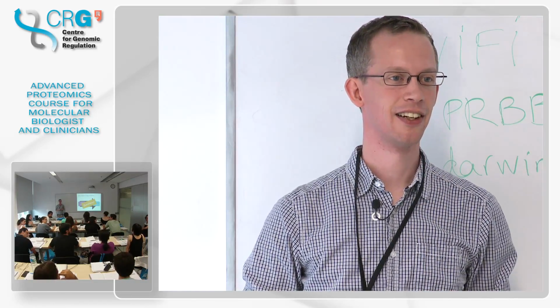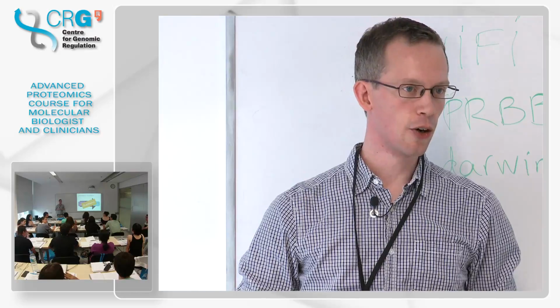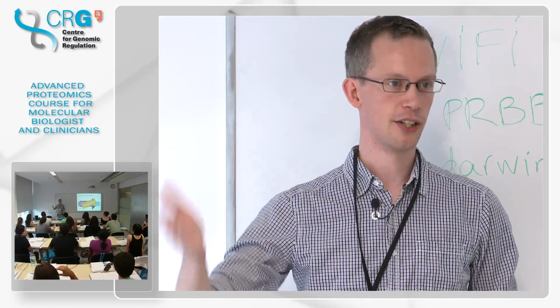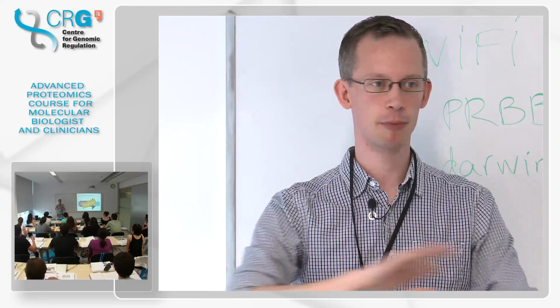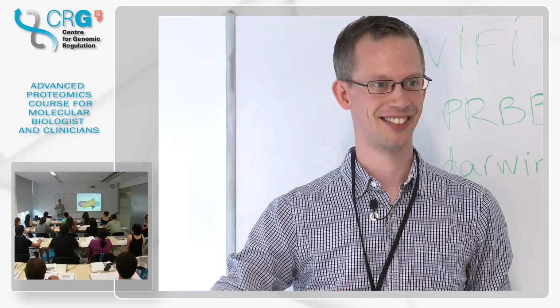Is that the general rule for every software, how they calculate this? So the target decoy approach, the paper I showed, for instance, was from 2007, right? So it's now a few years old. It's very much tested. On the peptide level, this target decoy approach has been implemented in almost all software packages, I think. So the FDR on the peptide level is there.